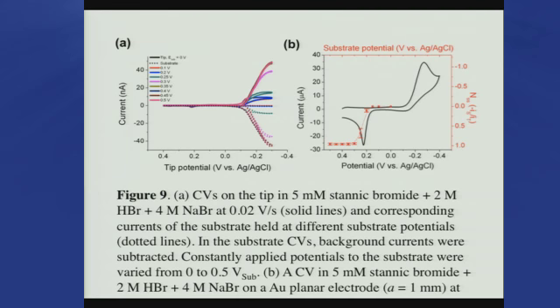If I put my substrate over here, where tin 2 goes to tin 4, I'll get the same thing I saw with ferrocene methanol. So I get the reduction wave here and the oxidation wave down here. And it's essentially 100% collection efficiency.